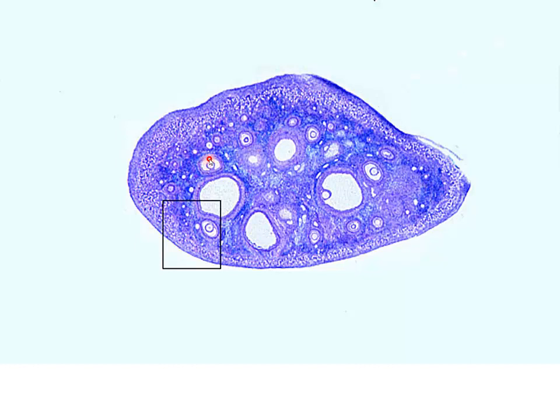Here we're approaching what could be a Graafian follicle. We still have it attached, so I would technically still call this a secondary follicle. But you can see how large some of these get. And there are a number of these, and this really supports the fact that throughout follicular development, a number of follicles develop, but usually only one is lost to ovulation.